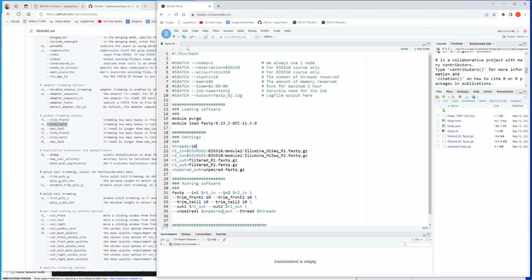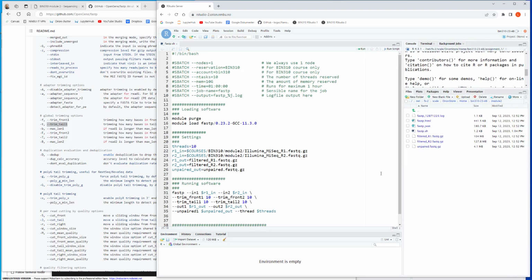It's the same file. By the way, before I run this now, perhaps I should change the name of the output, because if I rerun here now, it will overwrite the existing output files, right? It will overwrite these. So if you want to keep these and not change them, you should probably change the name of the output here now. So here's save to new files. Otherwise it will overwrite. I think I will overwrite them after all. I keep the same names, so these will get new versions.